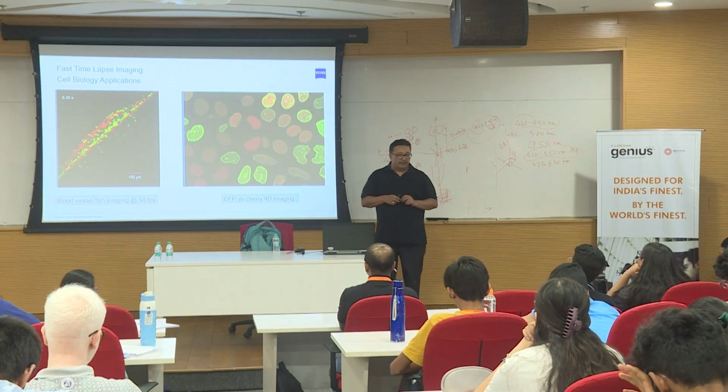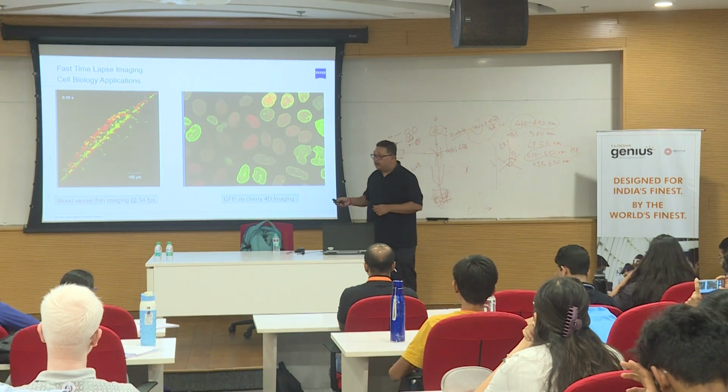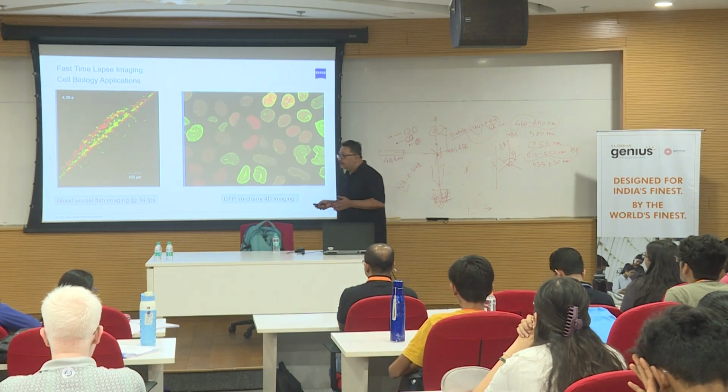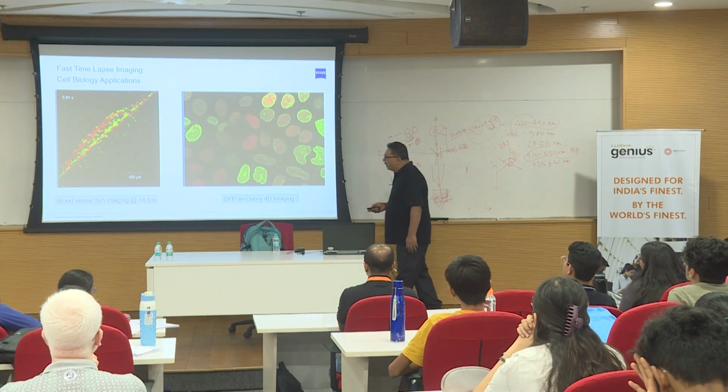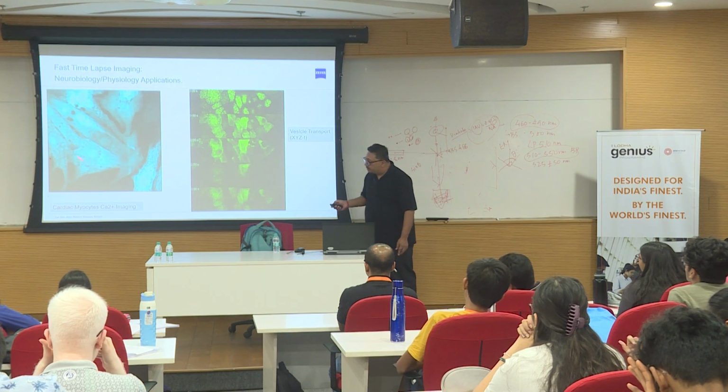So I need to create the incubation environment on the microscope. And all these things are now possible, or can be done pretty well on these systems. Good. So you can see another image, a cardiac myocyte.